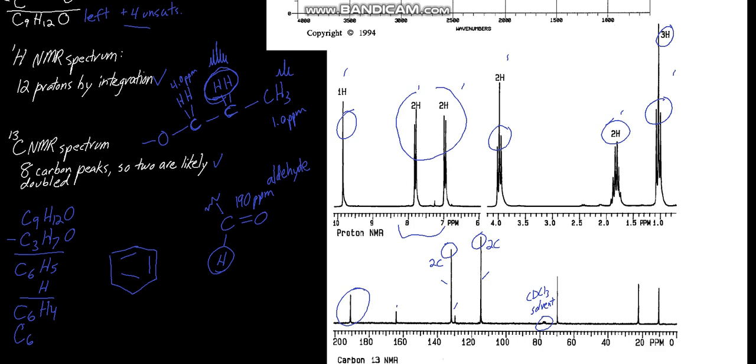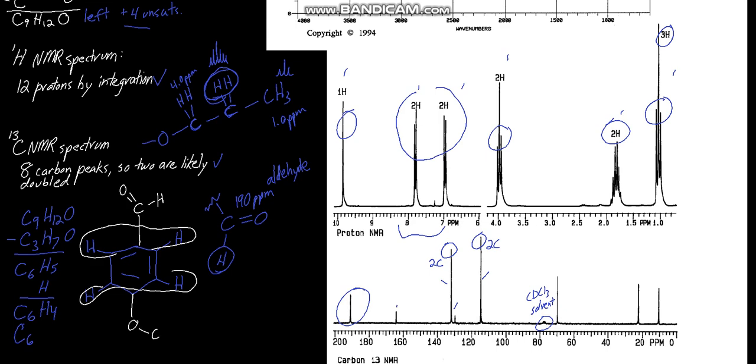Very important point. Okay, so these 2 hydrogens here, there's some symmetry there. It looks like they're doublets and they're equivalent hydrogens. So if you draw out all the possibilities, what you'll find very quickly is that the only way to get 2 hydrogens equivalent to each other across a ring like this is some kind of arrangement like this, where it's a di-substituted ring. Substituents like this. So in other words, it's para-di-substituted. What are our substituents? Well, we already have them here, right? And it doesn't matter which side they go on. And so we have this molecule pretty much proven at this point.